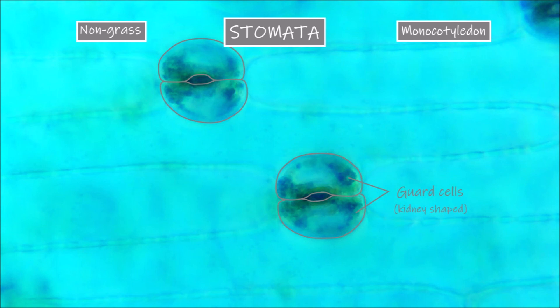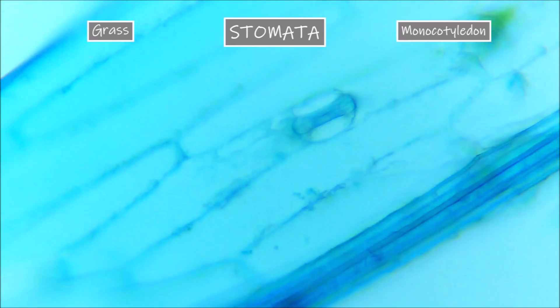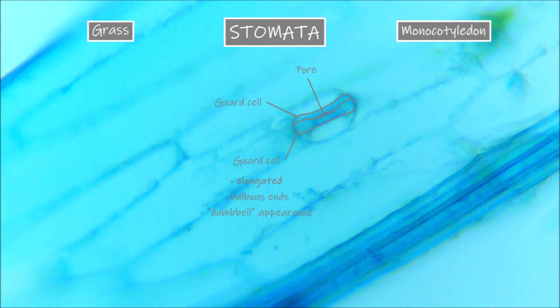These kidney shaped guard cells surrounding the stomatal pores are the typical shape found in dicotyledon plants and many monocots, but some monocots, especially in the grasses, have a different shape. If we now look at the surface of a blade of grass, we can see here the guard cells surrounding the pore are more elongated with bulbous ends, giving a dumbbell-like appearance. The stomatal pore itself is more like a long slit between these elongated guard cells. In these plants the guard cells have the help of subsidiary cells to help control the opening of the stomatal pores. The subsidiary cells flank the guard cells and are actually differentiated epidermal cells.